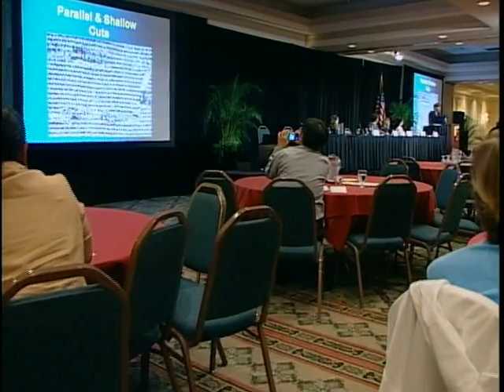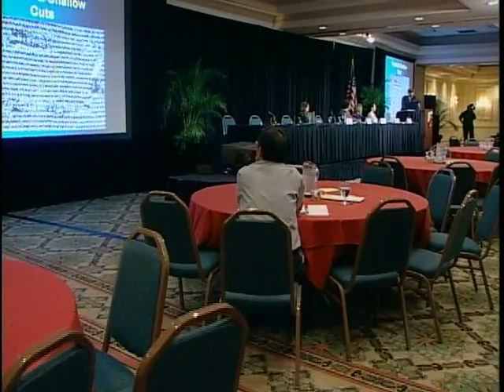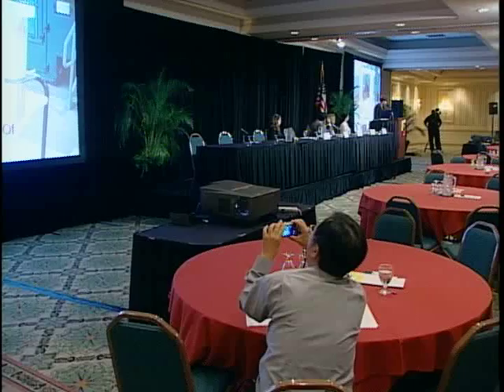I decided, okay, if no one else is going to do this research, I guess I'm just going to have to do it myself. So we got a student working for us for the summer. She rigged up a frame where a piece of glass could be clamped between two pieces of wood so that we could break a new piece of glass for each item of clothing.